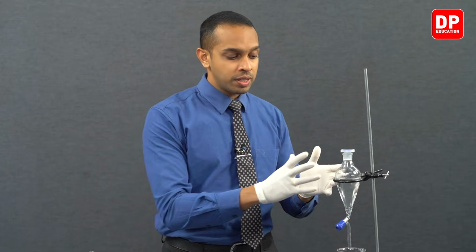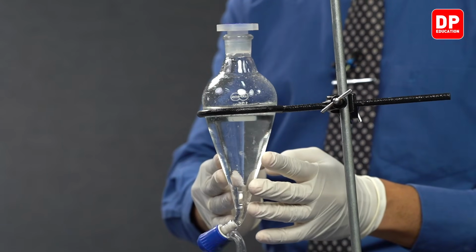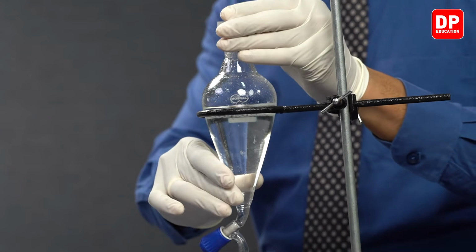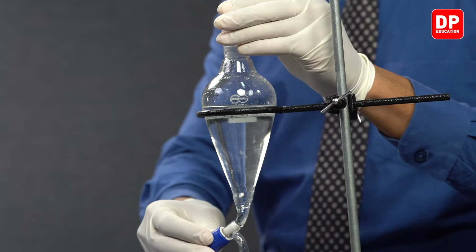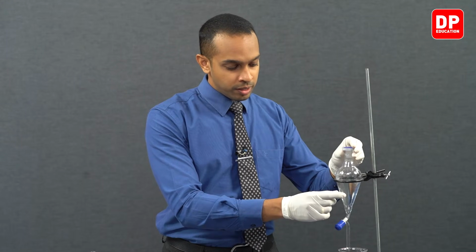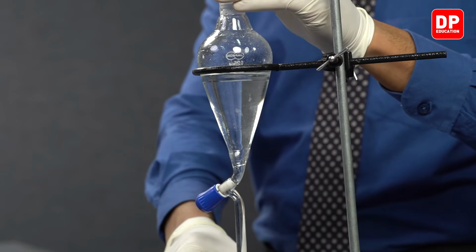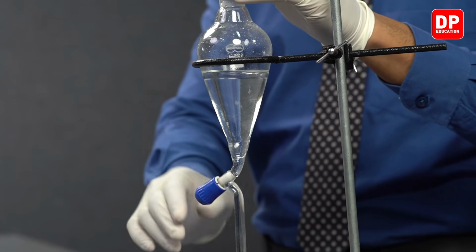This is because almost all of the essential oil is now dissolved in the diethyl ether layer. At the bottom what we have is our aqueous layer, and at the top we have our diethyl ether layer. So let's open the stopcock and allow the aqueous layer to get collected into our beaker that we have over here.